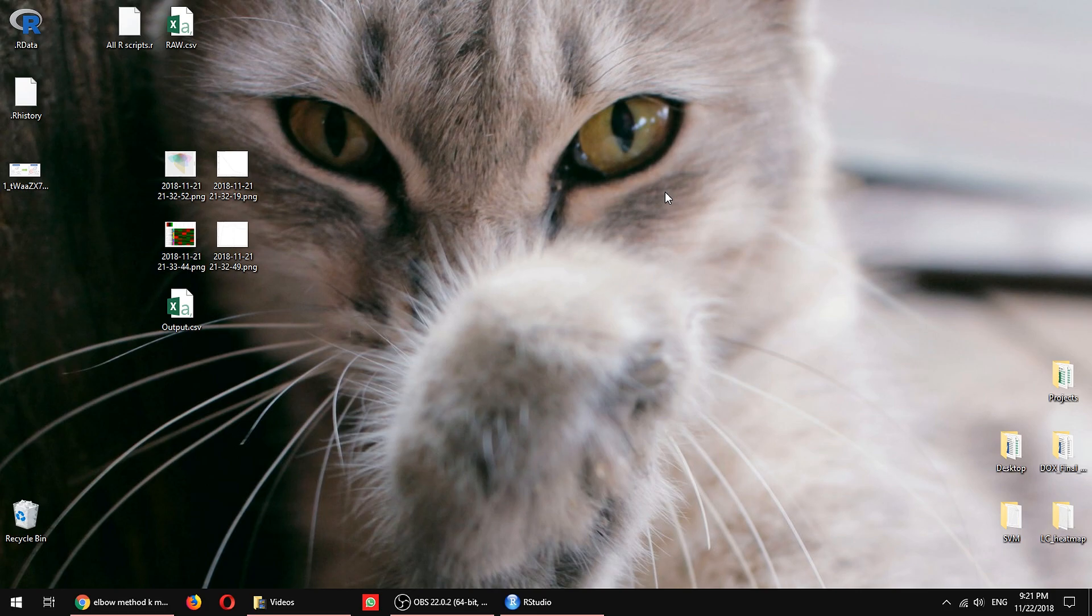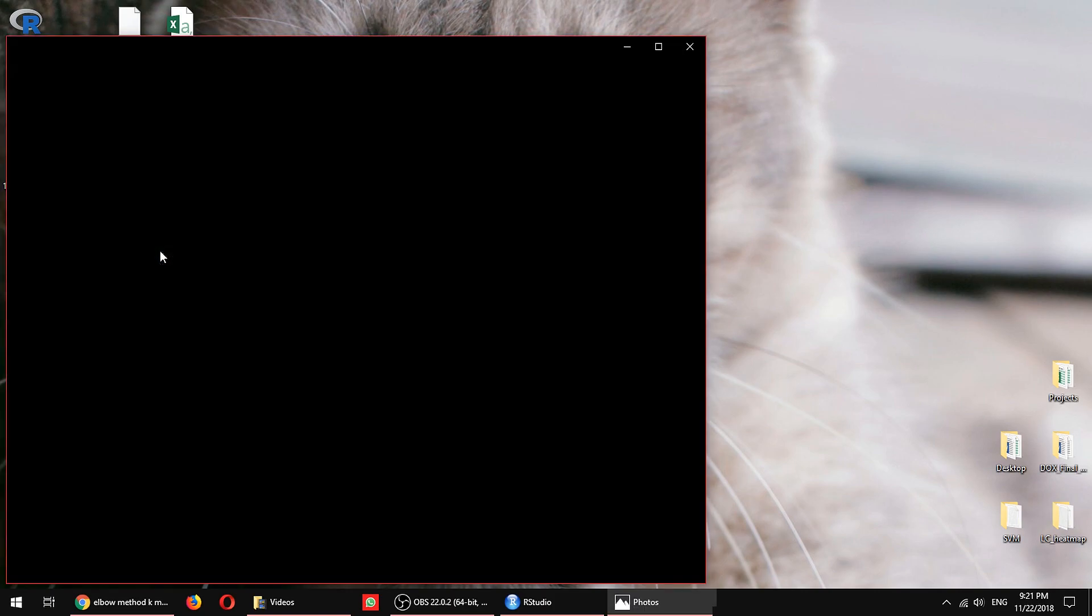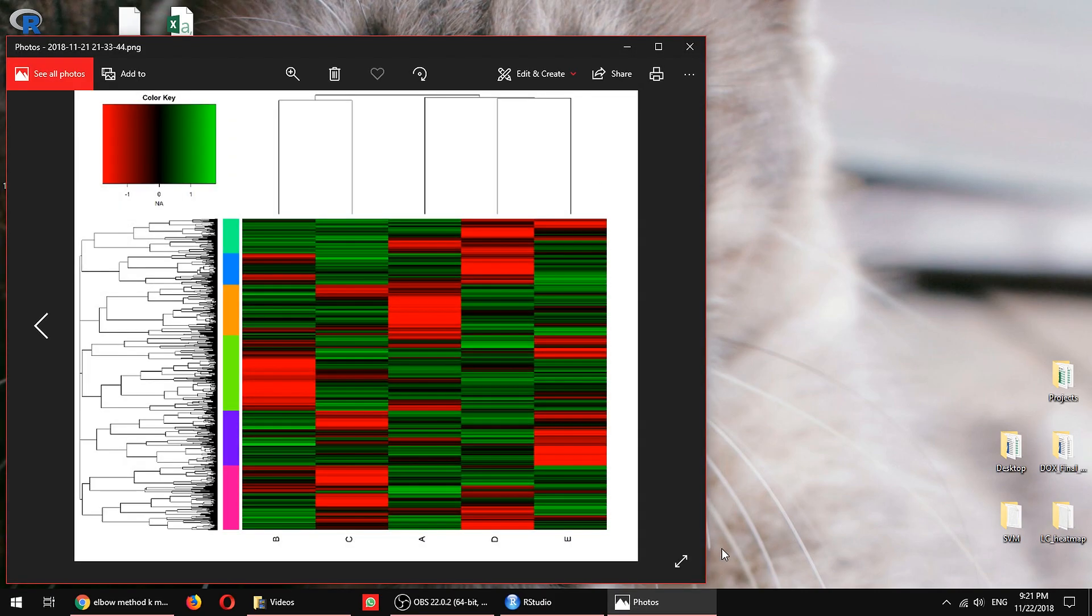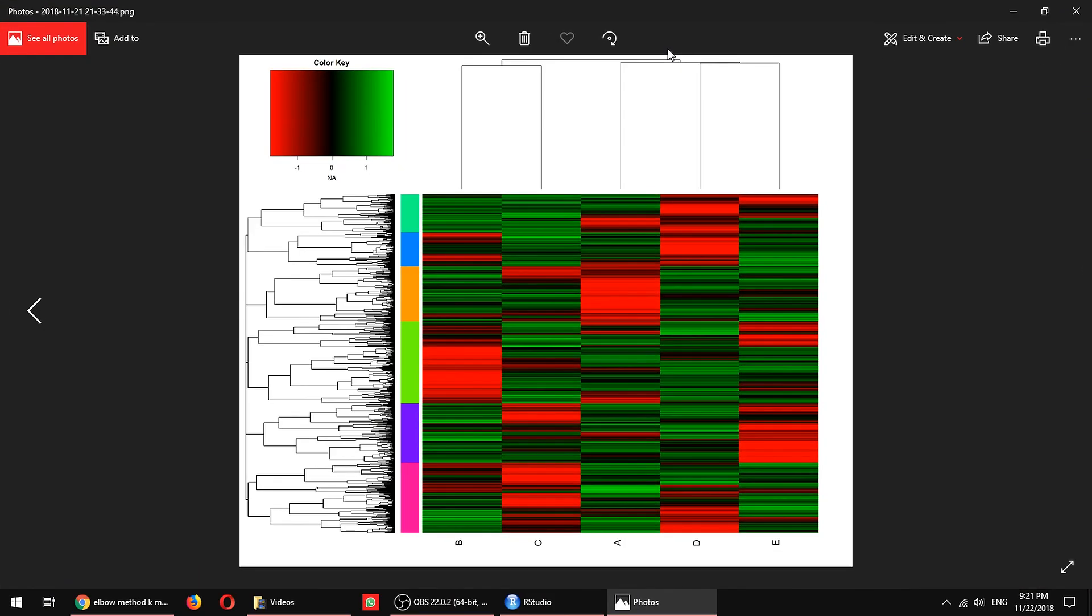In this case, what the end goal that we're going to be looking at is something that looks like this. Remember from last video, we have 5 samples, A, B, C, D, E, and we have about 5,600 genes.